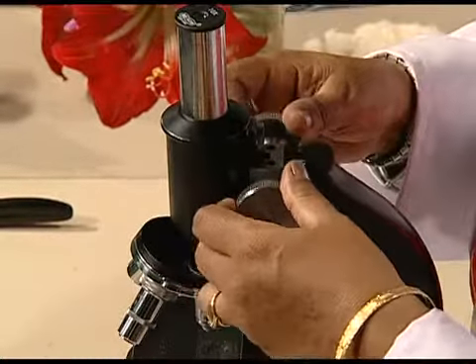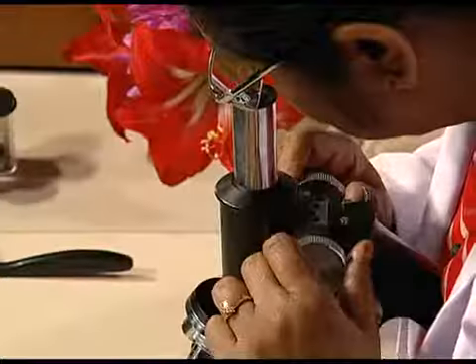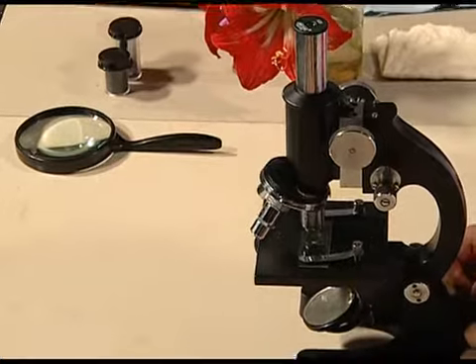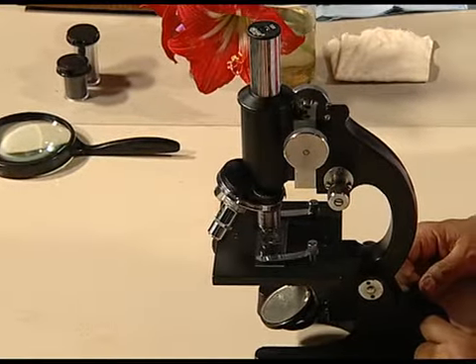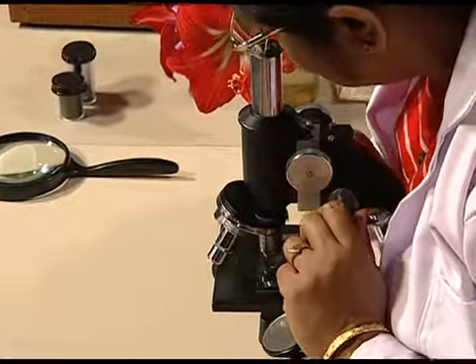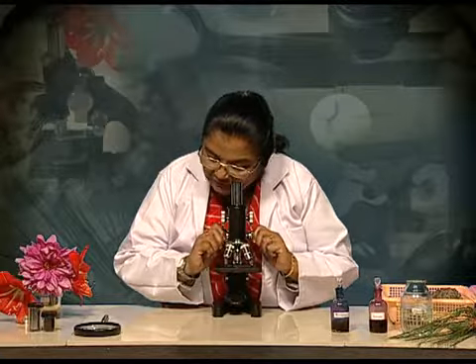After that, move the coarse adjustment in such a way that you can see the object clearly. After that, move the fine adjustment knobs to further sharpen the image of the object.